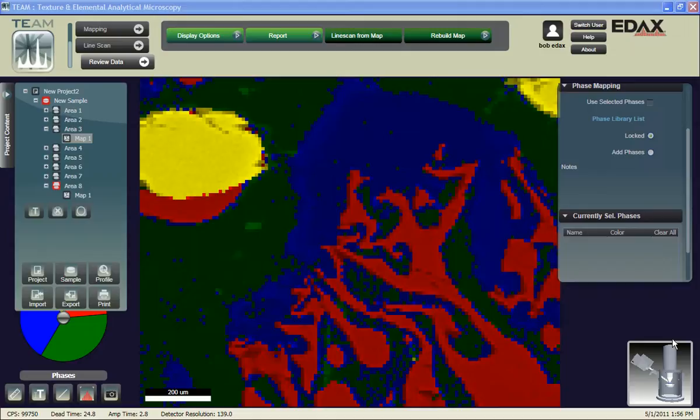But again, we're going to tell the software, don't bother discovering all of these phases. Here's at least a minimum set of phases we want you to use. And in some instances, this will do a little better job when we have some fairly complex or, in some cases, phases that are quite similar to each other. And we have that situation in the phase map we're looking at.